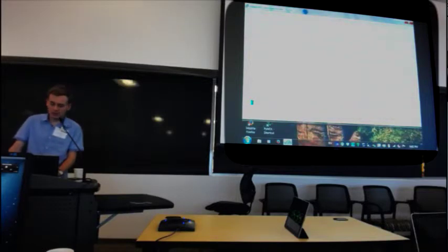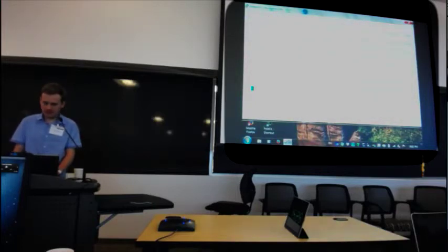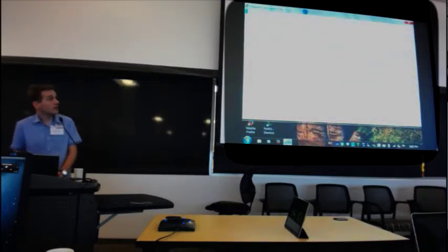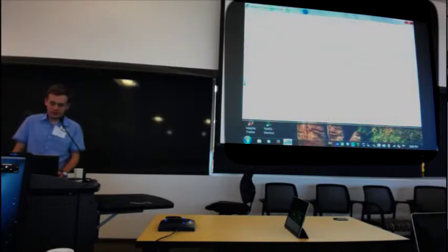Okay, so have you successfully submitted the indexing job? Where are the indexing parameters? I haven't said that the indexing parameters are in CrystFEL.txt. More or less, yes. Here they are. I won't go through all of them. You can read about that in the manual for CrystFEL.